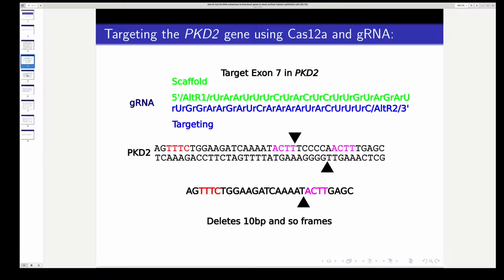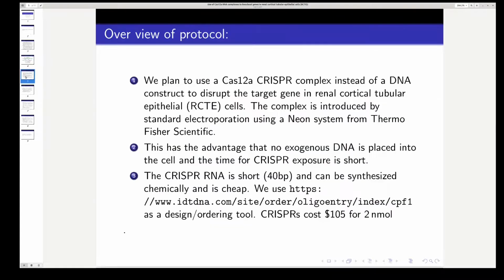Now we're going to do this for PKD1 and PKHD1. We've already done that. I'm also going to do it for CU62 because I've got 2 monoclonals for that one, and I really need to make sure that they're cognate to their target. I'm pretty sure they are, but you've got to make sure.